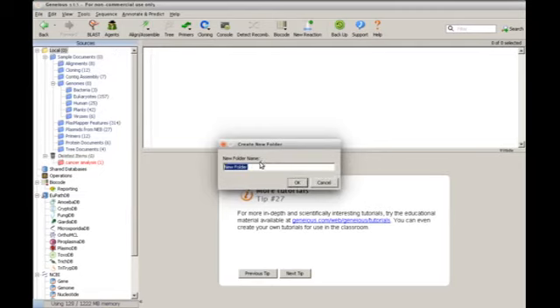So we're working on DNA analysis, but mind you, we are working on a project which is sickle cell. From the beginning we have been working on sickle cell analysis on the database and internal tool. So that's the data we'll be using. And all the assignments you'll be given, it is expected of you to follow the same process to be able to work on your assignments perfectly according to the way you are being taught.